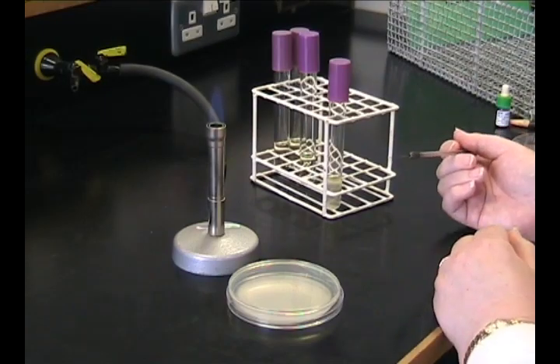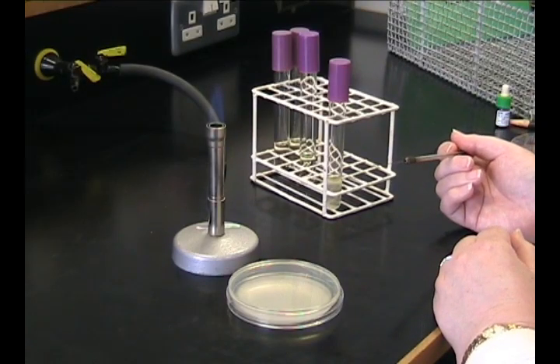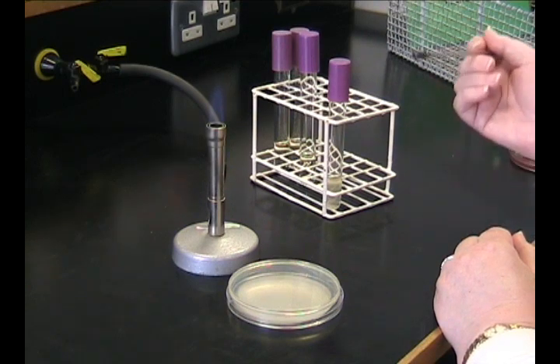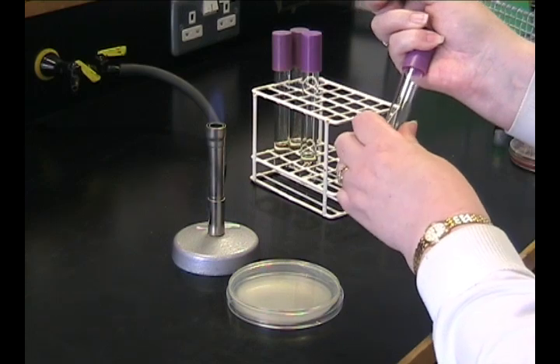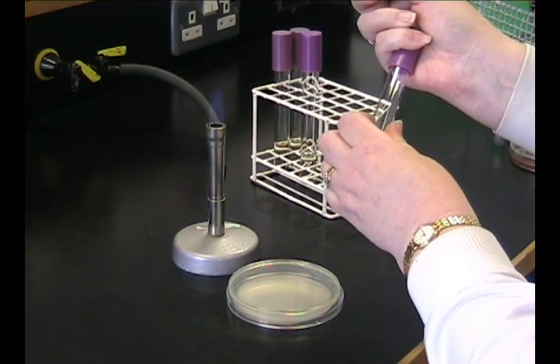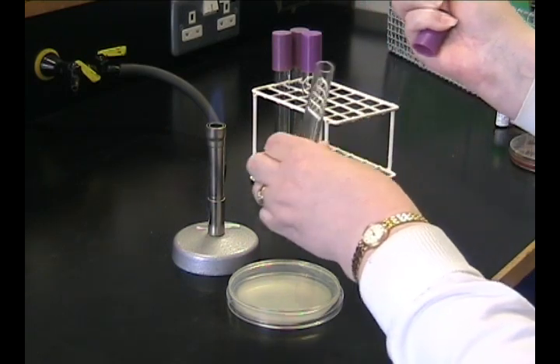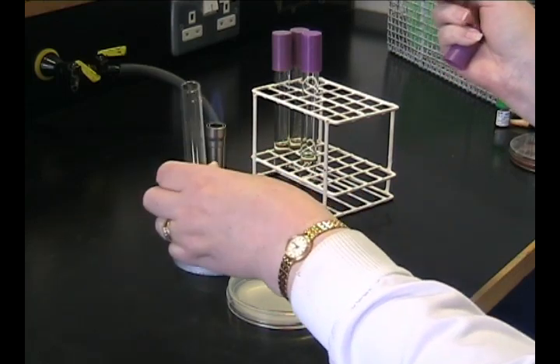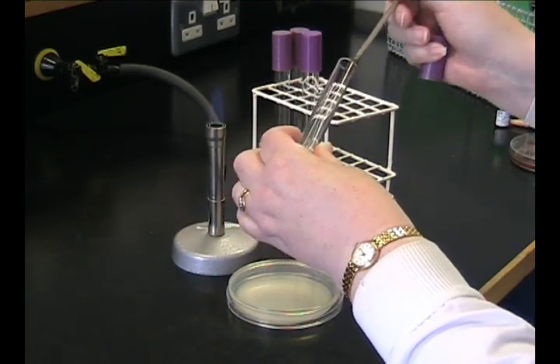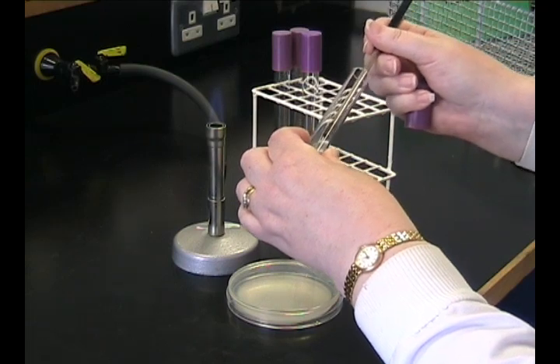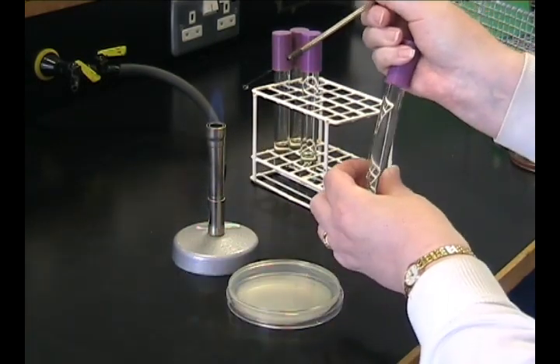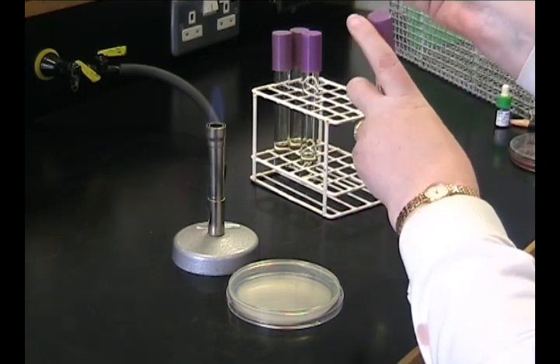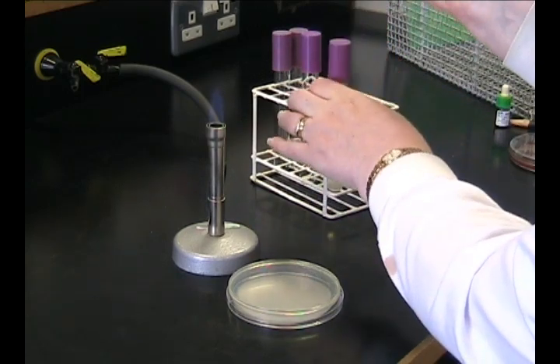To inoculate from a broth culture, use the same technique as before. But holding the test tube, remove the cap with your little finger. Make sure you flame the neck of the test tube through the Bunsen burner. Using your cooled and flamed loop, remove a drop full, a loop full of bacteria. Place the lid.